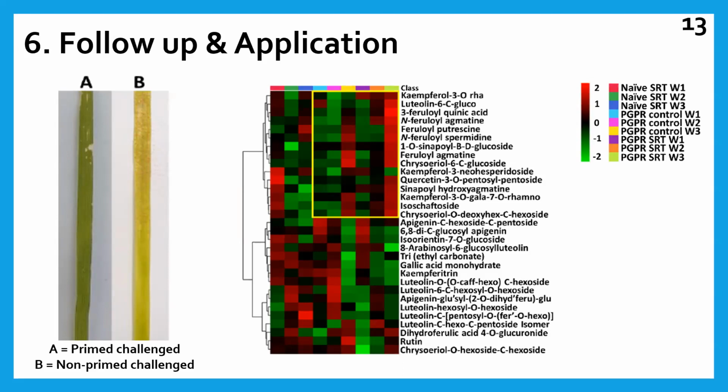So the phenotype that we observed was more or less supportive of the profiles that we're able to see, and those are an indication of the mechanisms that actually are happening in the rhizosphere itself between the plant and the microbes that are involved in the rhizosphere. So this was a great demonstration of the metabolic changes associated with induced systemic resistance against the pathogen in the primed plants. So the whole train of activities was very insightful when we observed what happens in the rhizosphere itself.